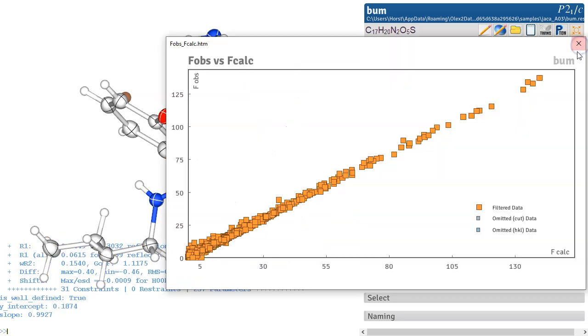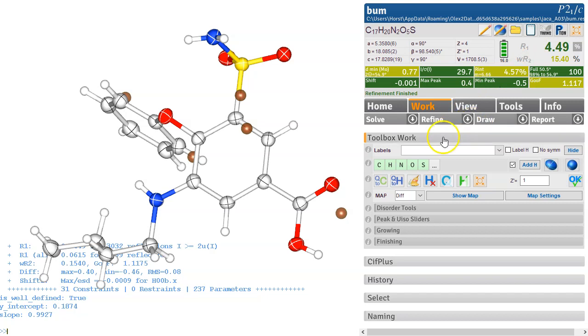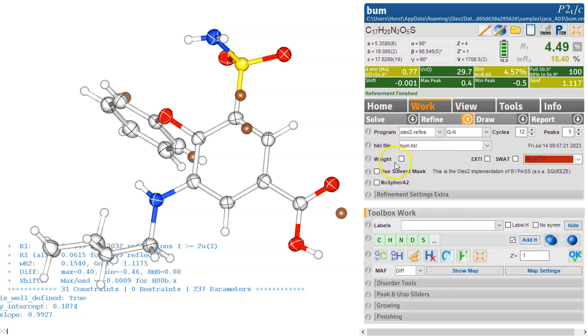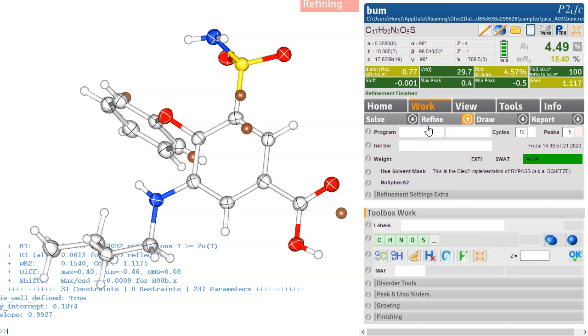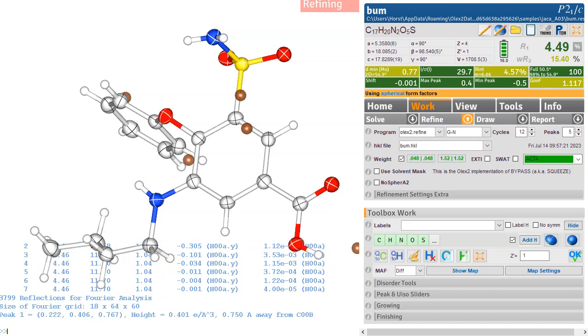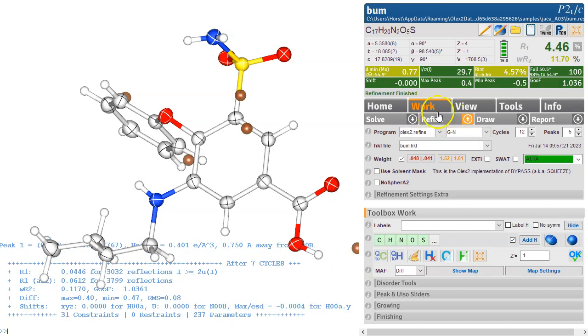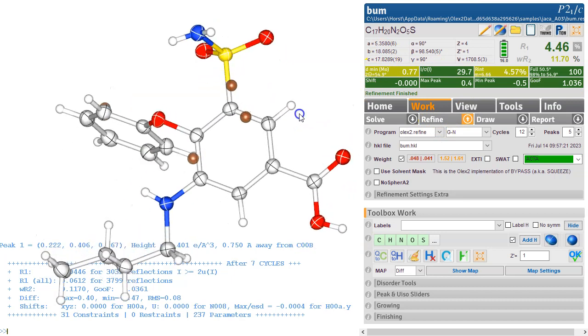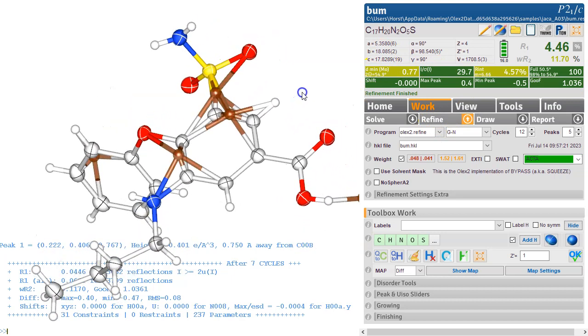Let's just check over here. So this is nice and straight. And we see whether we've got the weighting scheme on that we haven't got the weighting scheme on yet. So we need to switch the weighting scheme on. And also ACTA, of course, to get a CIF file in the end. So let's just refine this with the weighting scheme on, and it's all settled, and it's all fine.